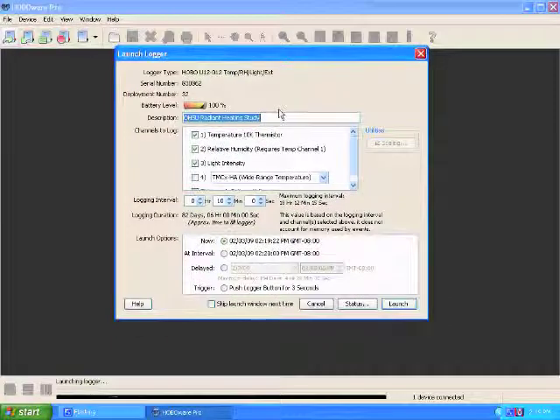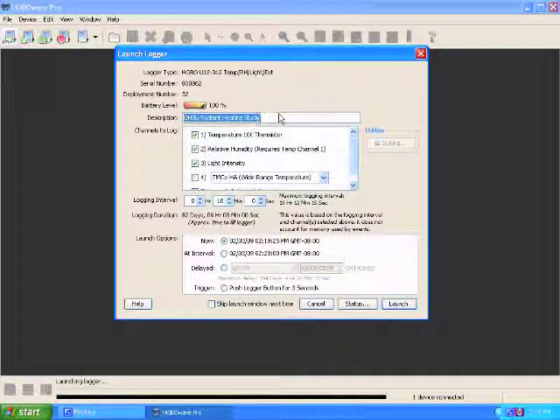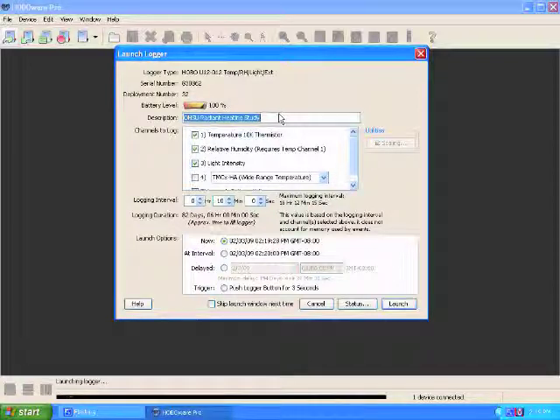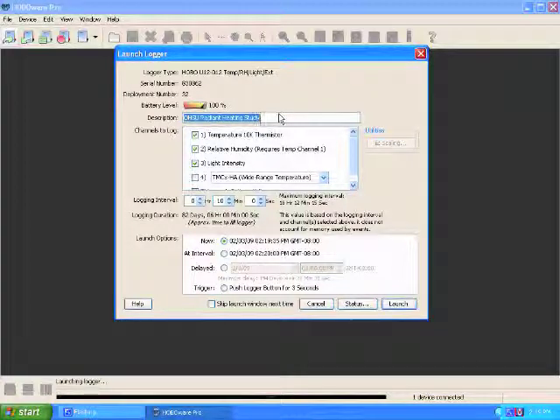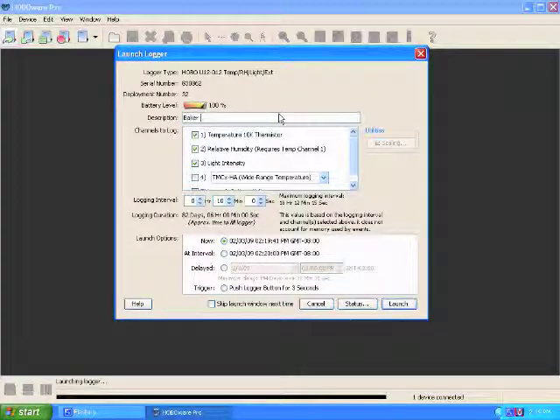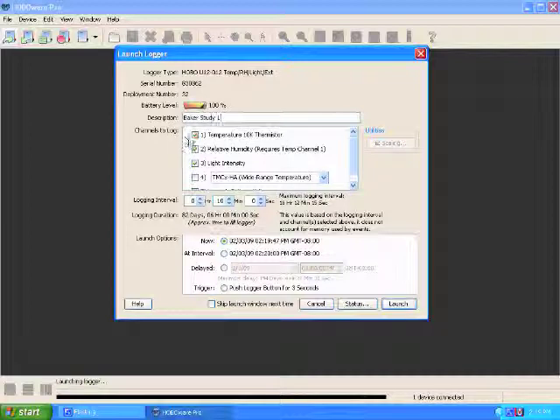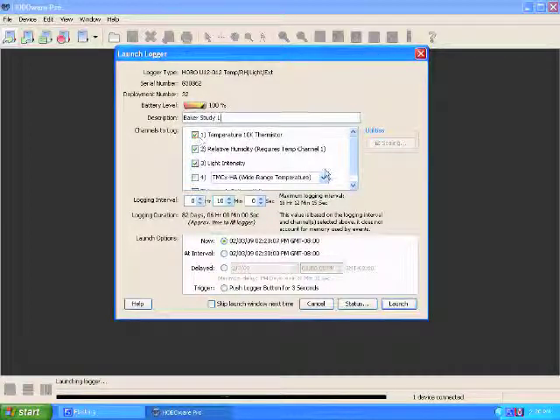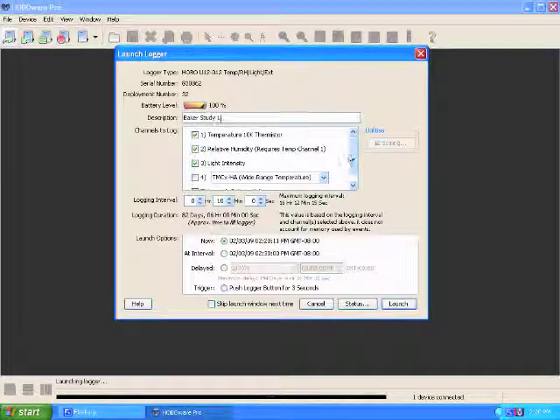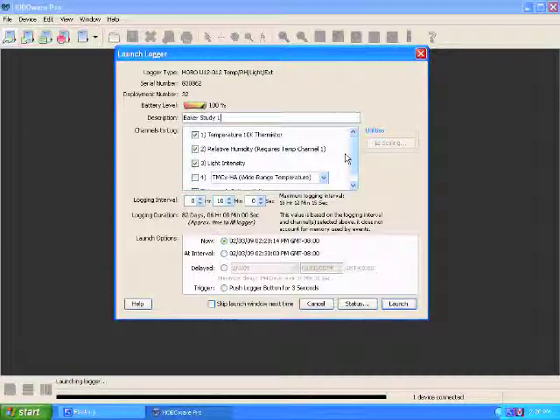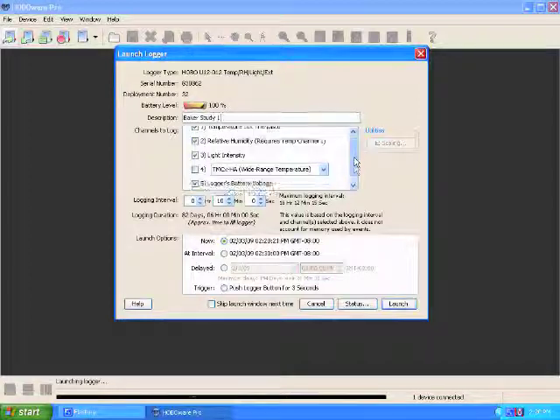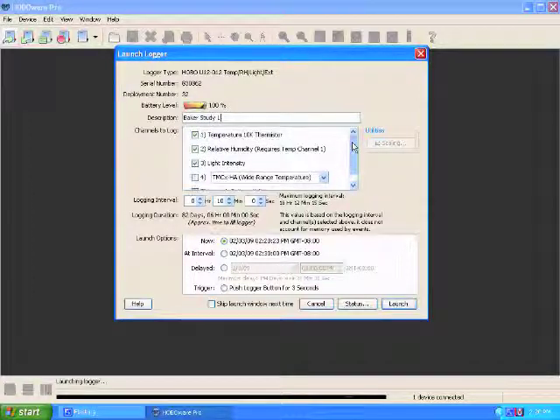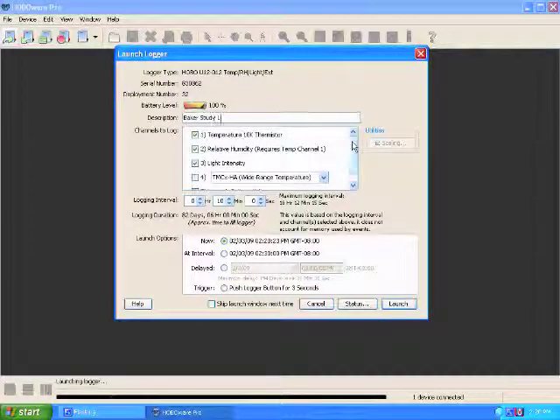First, choose a name that's relevant to your project. And you may want to either number your Hobo or choose different names if you are launching more than one, so you can keep track of which one is which. These boxes here choose which of the available channels your Hobo data logger is tracking. If your study is only using, say for instance, the temperature reading, you may want to leave the other boxes checked and continue taking data for those data sets. You might find something that's interesting or another direction for your study to take.